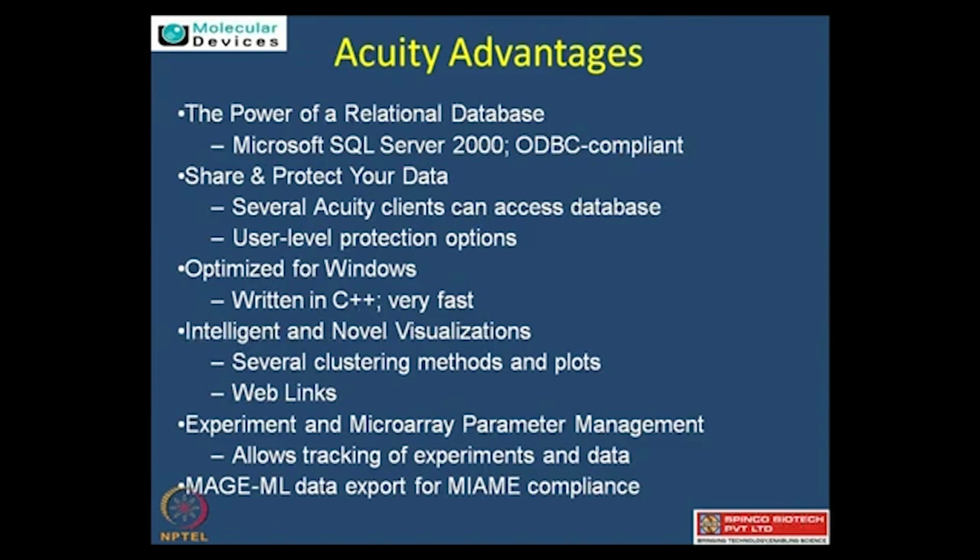So I guess the last 2 points which you mentioned, one is tracking the data based on the experiments, right? I think that's very important. That's also depending upon the need of the experiment. One needs to track and make the software learn your experiment so that one can actually apply the same knowledge for the various slides throughout to track that data set. Yes.